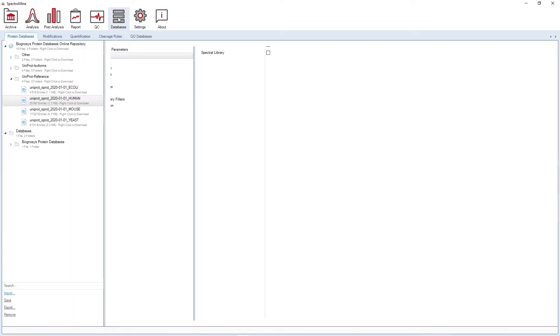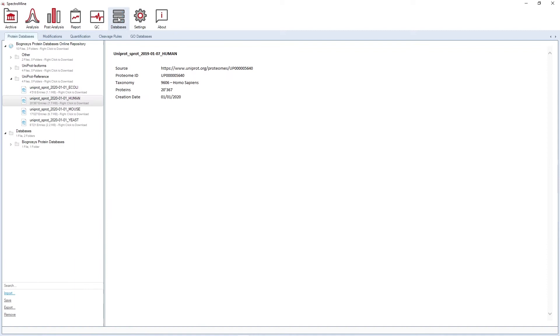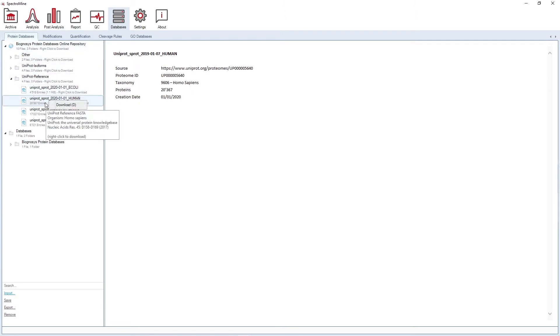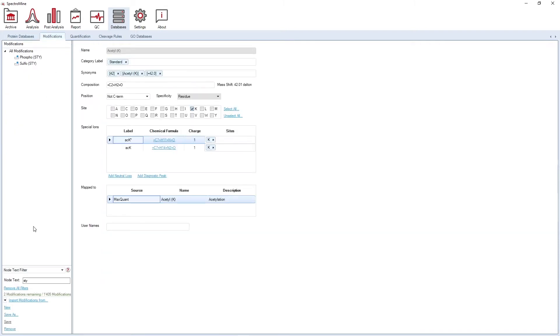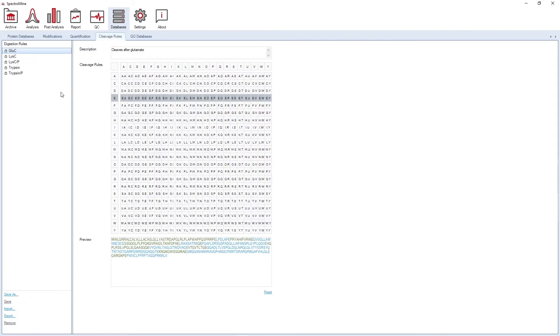Under databases, you can find several resources such as protein databases, FASTA files from our online repository. You can download several of them. We have a comprehensive modification repository where you can find several modifications and labels, but also generate your own modifications in case you work with one that we don't have. Similarly, you can also generate your own cleavage rules. We have a list with the most common enzymes, but you can also generate your own.